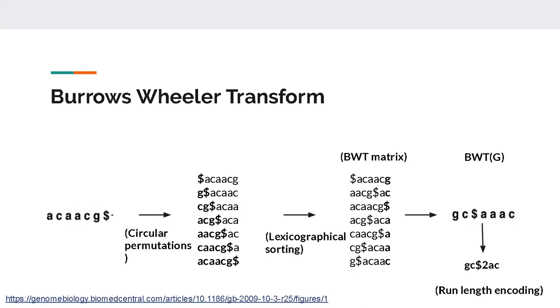So it is not just making the data. For example, if you make a human genome database, you can always download the human genome indexed sequence from, let's say, the UCSC browser. Whenever you are carrying out read mapping, for example SNP analysis or RNA-seq analysis in human, you are not going to do the indexing every time you begin the analysis.